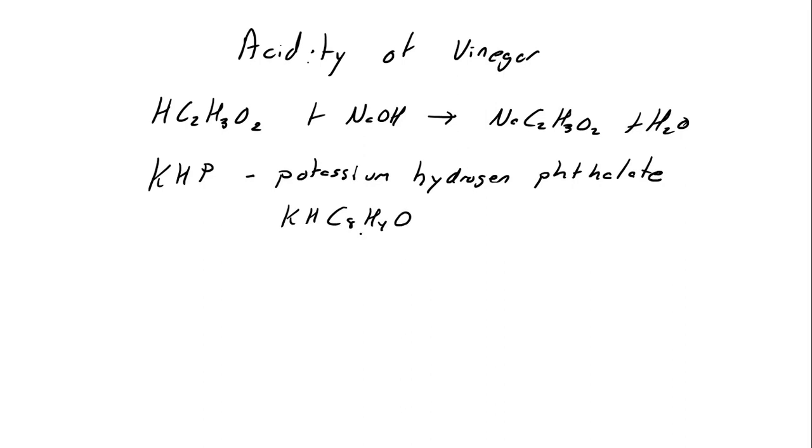Okay? So that's this right here, the phthalate. And so KHP plus the sodium hydroxide goes to form KNaC8H4O4 plus water.